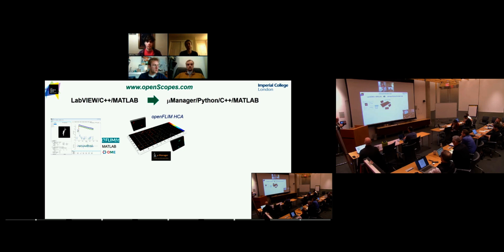And I would show you a beautiful image of what we call Open Frame, which is a microscope frame that can be built for a couple of $1,000s, on which you can build STORM or FLIM or pretty much anything else you want to do. It's open source. We've already made the CAD files widely available, and if you go to www.openscopes.com, you'll be able to see our open source software and the CAD files for the open microscope frame.